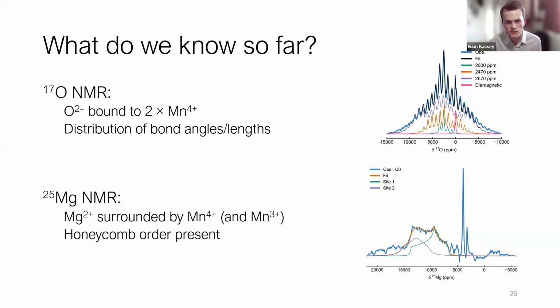One of the things that you can see is this diamagnetic resonance, which is quite strong here, and this is essentially from the surface crud on the material. I guess it's the sodium carbonate and hydroxides and so on. I think it is at least low in the bulk, because based on SEM and so on, it seems to be consistent that it's all the way through, or at least most of the way through. So yeah.